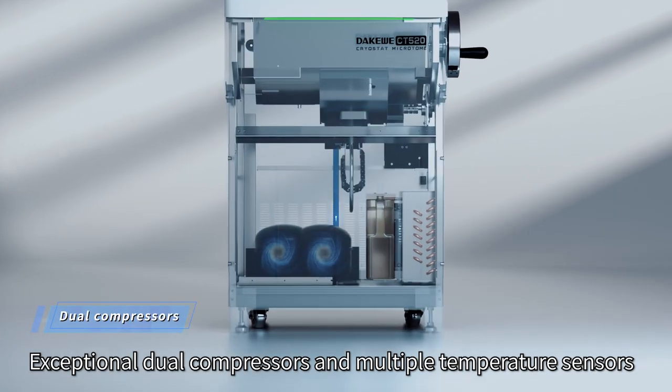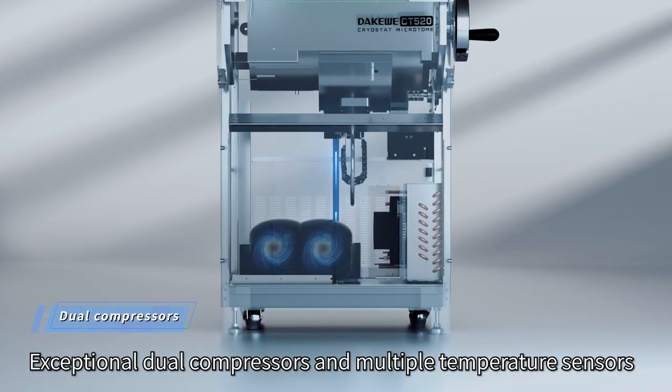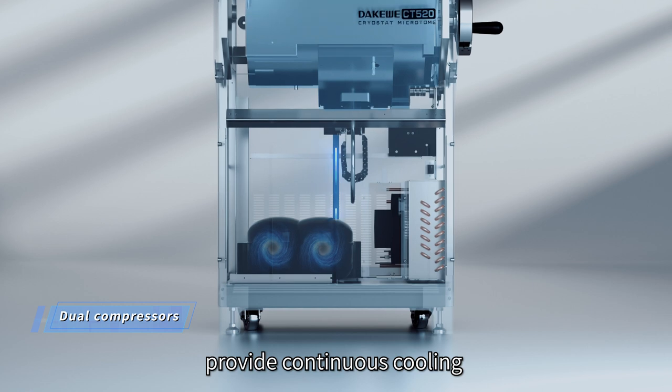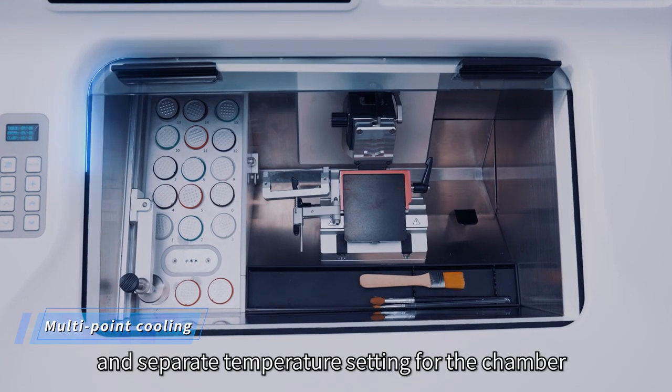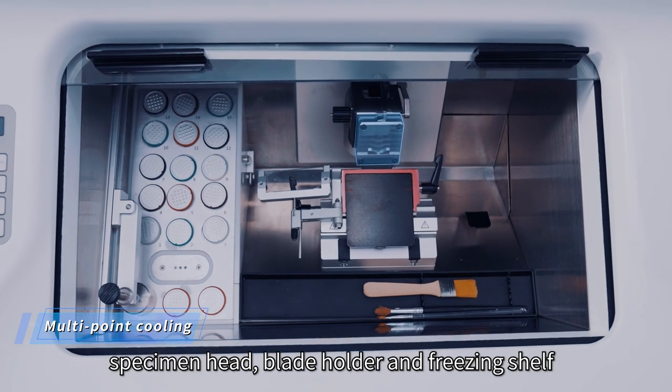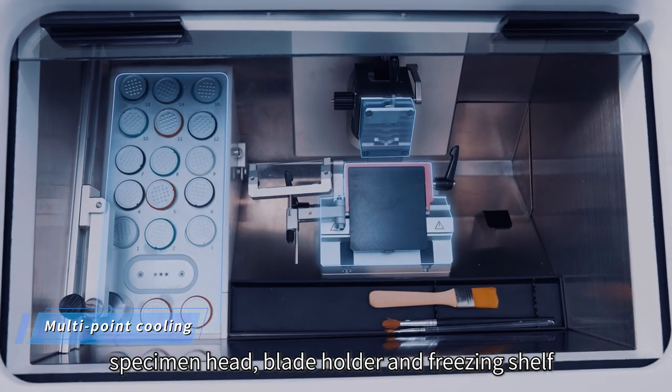Exceptional dual compressors and multiple temperature sensors provide continuous cooling, dedicated temperature control, and separate temperature settings for the chamber, specimen head, blade holder, and freezing shelf.